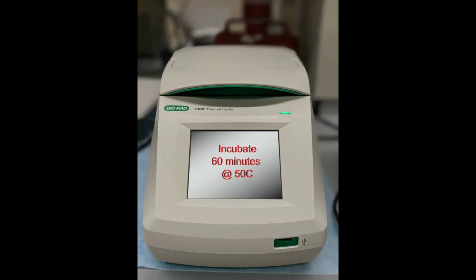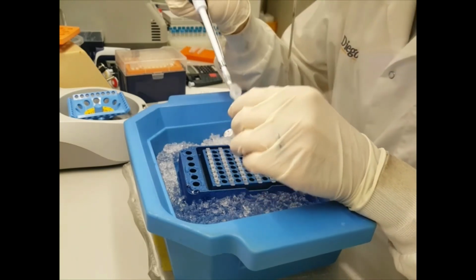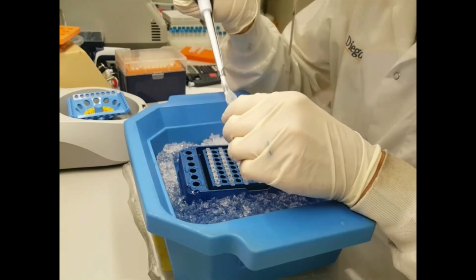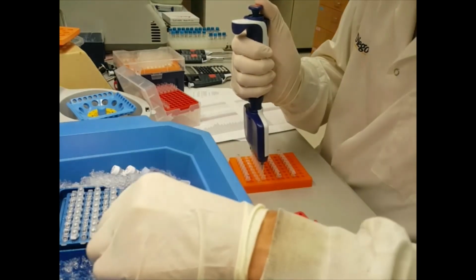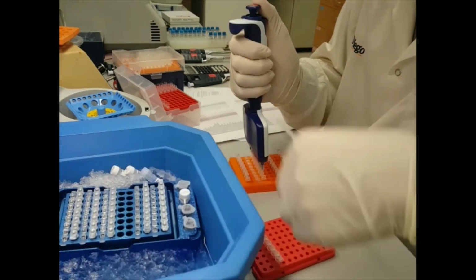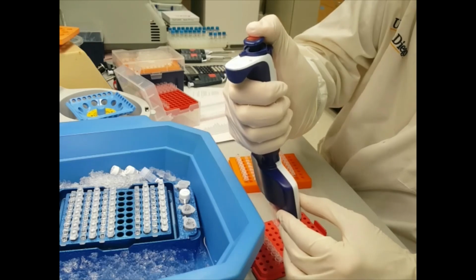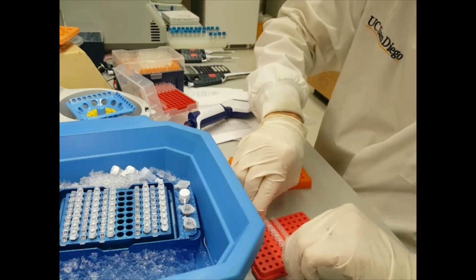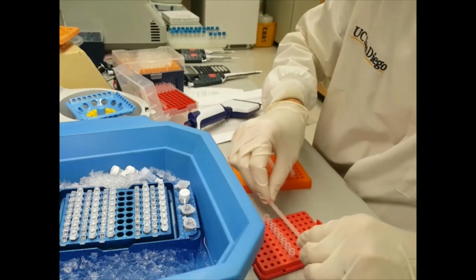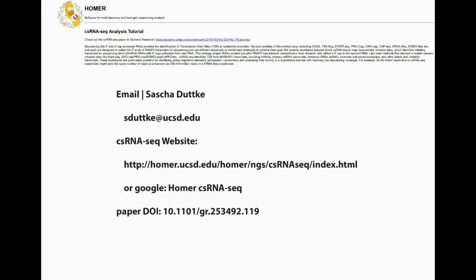This should be plenty of time for you to prepare the PCR reaction and the barcodes. As with the other reactions, I pipette the PCR master mix into the PCR lids, and then, usually using a multi-channel, add the barcode primers. Once the RT is completed, well, we just exchange the lids and start the PCR reaction. If this was all a little fast, please note that below we provide a PDF with detailed instructions, or visit our home website for the latest version of the csRNA-seq protocol.